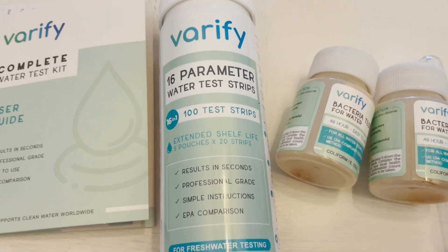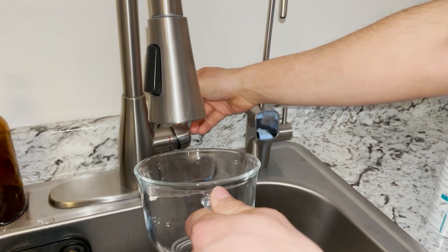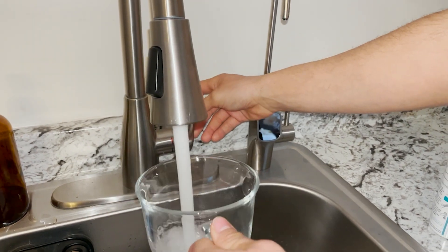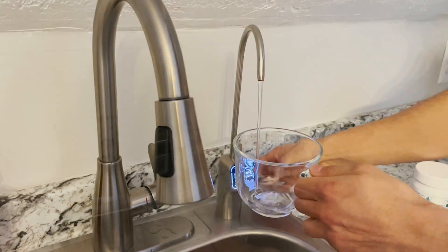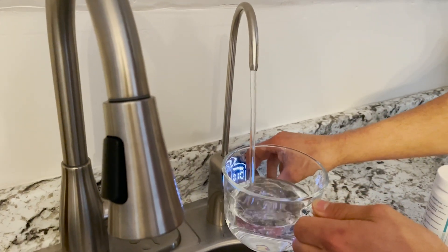We just got a water filter, so we wanted to test it — that's why we got this kit. It was very simple. We added some tap water in a cup, then some filter water. We placed them next to each other: the tap water and the filtered one.